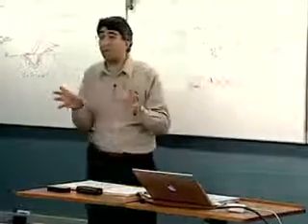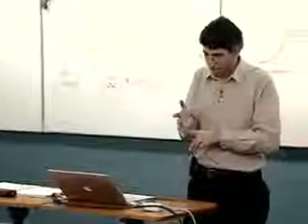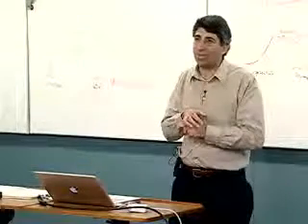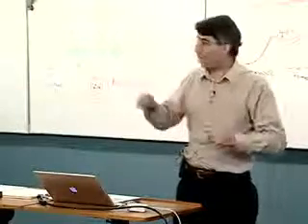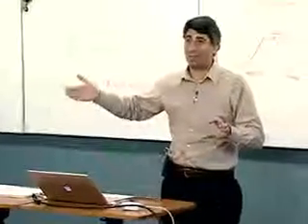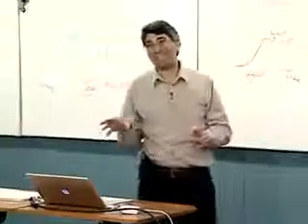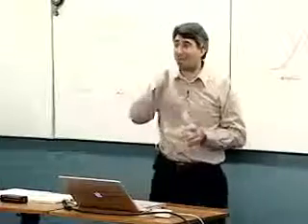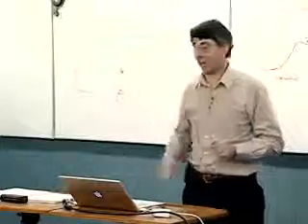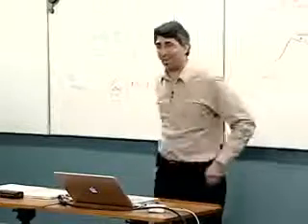That might be kind of obvious, but what about the potentiostat itself? There's a couple things you have to watch out for here. Number one is there are some potentiostats that will allow you to drive them faster than they're designed to be driven for some reason. That is, there are knobs or buttons on them that let you go at 10 or 100 or 1,000 volts per second, and yet actually the electronics in the potentiostat can't necessarily keep up with that. That is, you may be able to ramp your power supply at that rate, but that doesn't mean that your current following can occur at that rate. So one has to make sure one has a potentiostat that can do what it's promised to do.